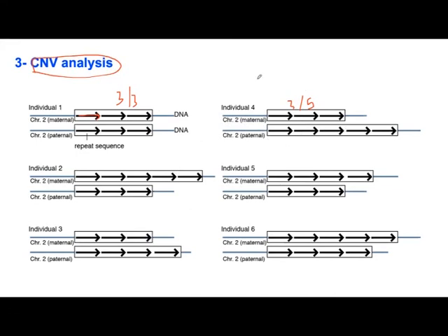So this is actually what you use. Even people use this technique to do DNA fingerprinting. Actually, if you go to the police now, they do what is called DNA fingerprinting, and they use what is called microsatellite repeat. And those repeats, you can actually analyze using a Sanger sequencing machine, fragment analysis. But sometimes you do get a problem. If this repeat size is small, you can use HRM, no problem for you. Sometimes if the repeat is like a microsatellite, then you can use the Sanger sequencing machine.